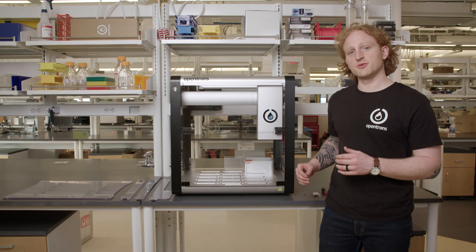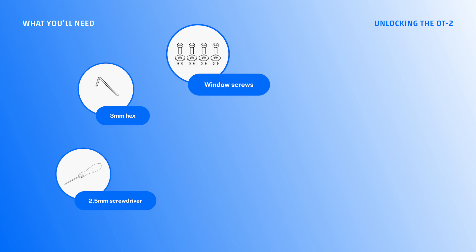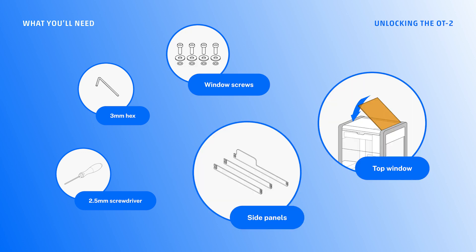For unlocking the OT2, I will need the 3mm hex, the 2.5mm hex screwdriver, the top window screws, and the top window as well as the side panels.